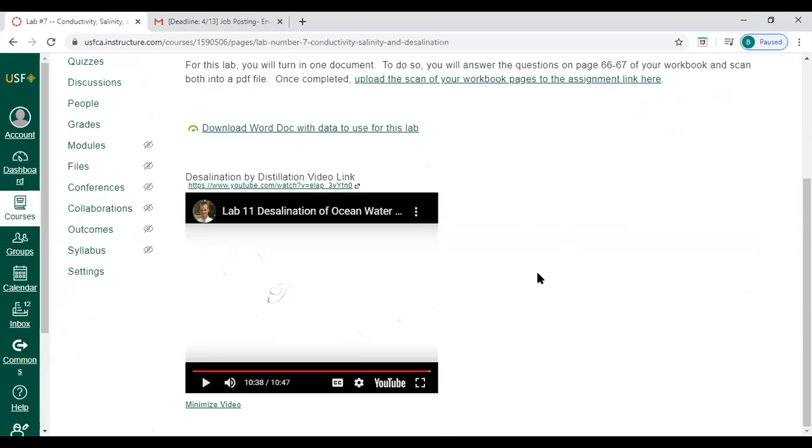So that's the exact lab that we would have done. The only few differences is that we would have used a hot plate instead of a Bunsen burner. And the units that they measured conductivity in is milligrams per liter. You don't really need to know this that much, but that translates exactly to parts per million. We would have measured conductivity with the same exact probe, just it would have gone to the Hawk meter that we saw a video of yesterday or last week.